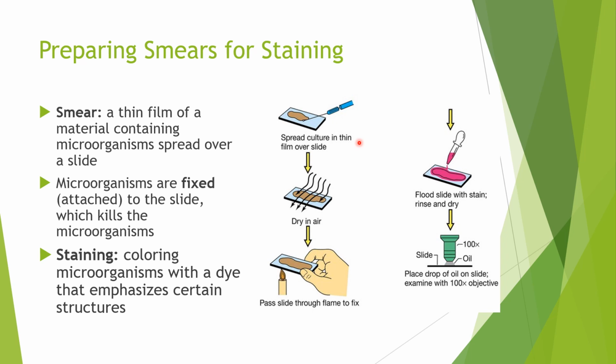If you put too much of your specimen on your slide, that's not a good thing. You're not going to see anything under the microscope. It's going to be way too much specimen, and you're not going to be able to figure out the features of the microbe that you are looking at. So it's best to have a very thin spread of that specimen on your slide, and we're going to explain in lab how you do it, and what tools you use.